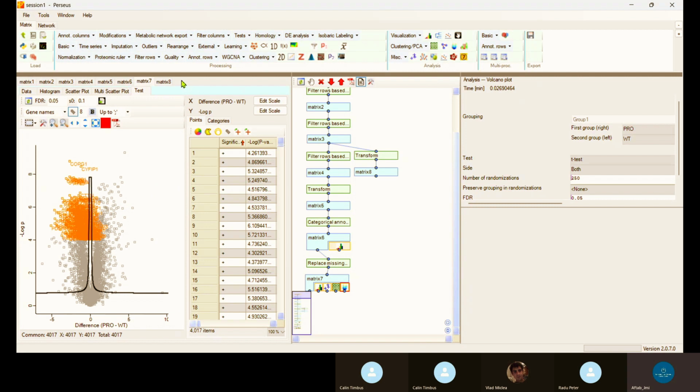Yeah. Like for imputation, there is one more option. If you use an R program, there is a method. Exactly like that. So here you can select your R script. Okay, that's good. These are another method. In the Perseus bin file, we have to provide the R file, the R script. Then we select. For this selection, you have to open the R platform in a different window. Like here, I already opened the R platform, so that's why it looks green. Otherwise, it looks different. Okay, good. So you can use your customized script here also. That's great.